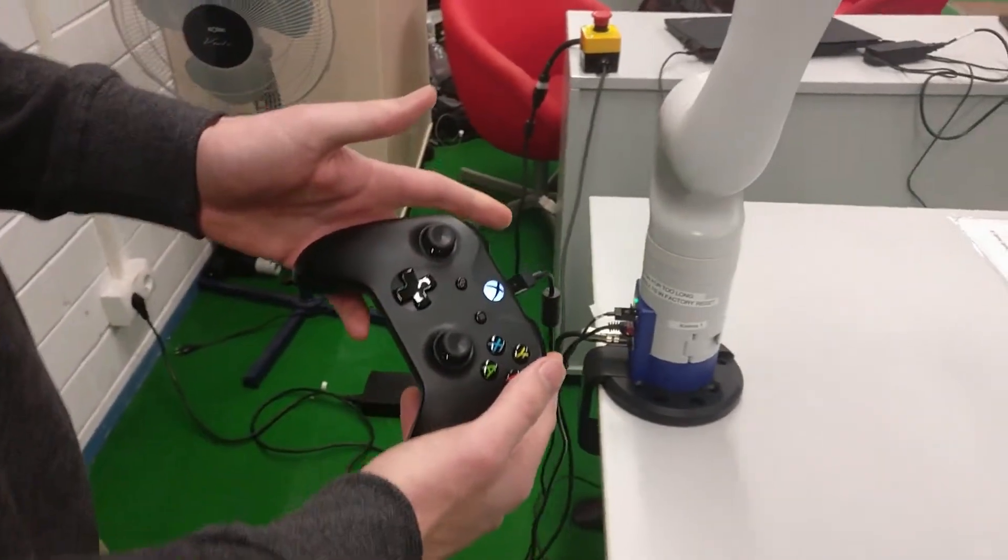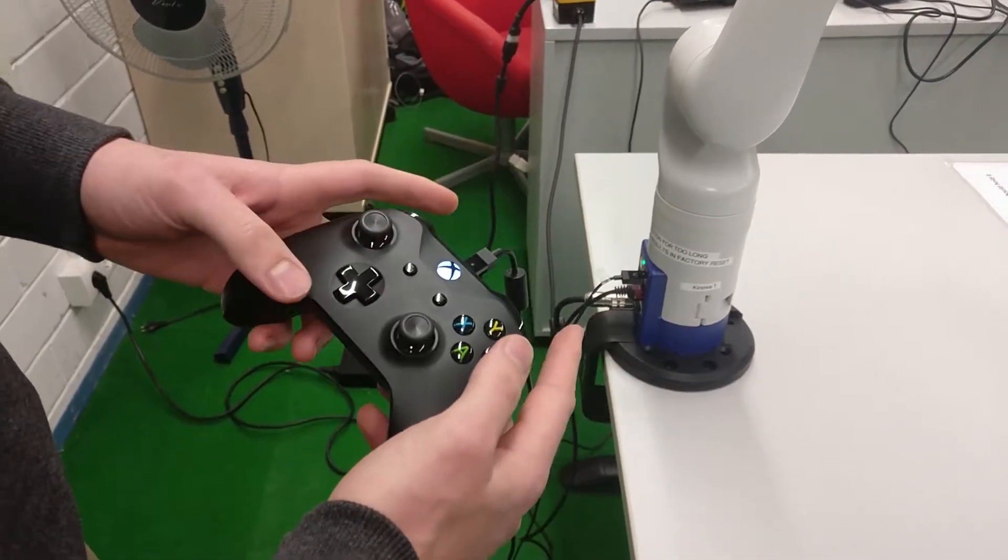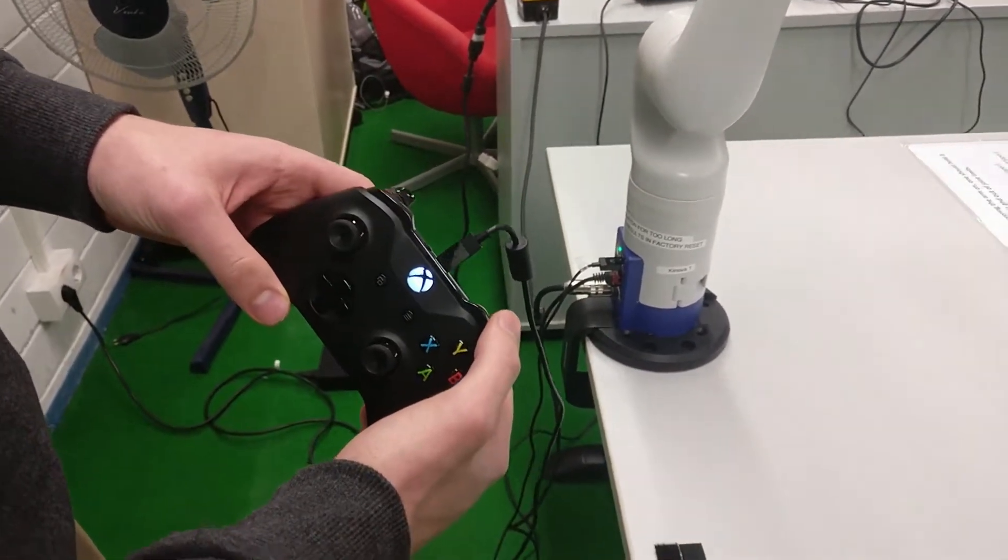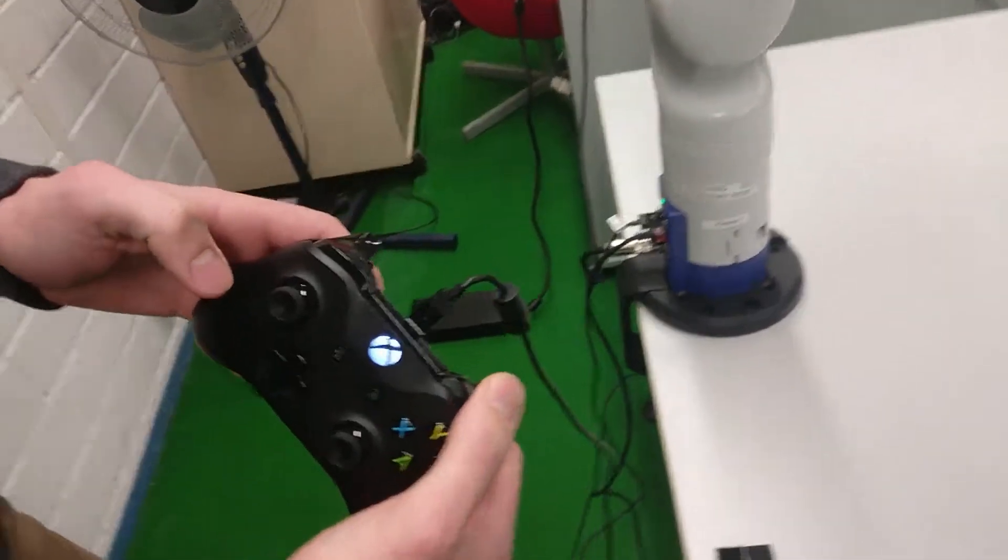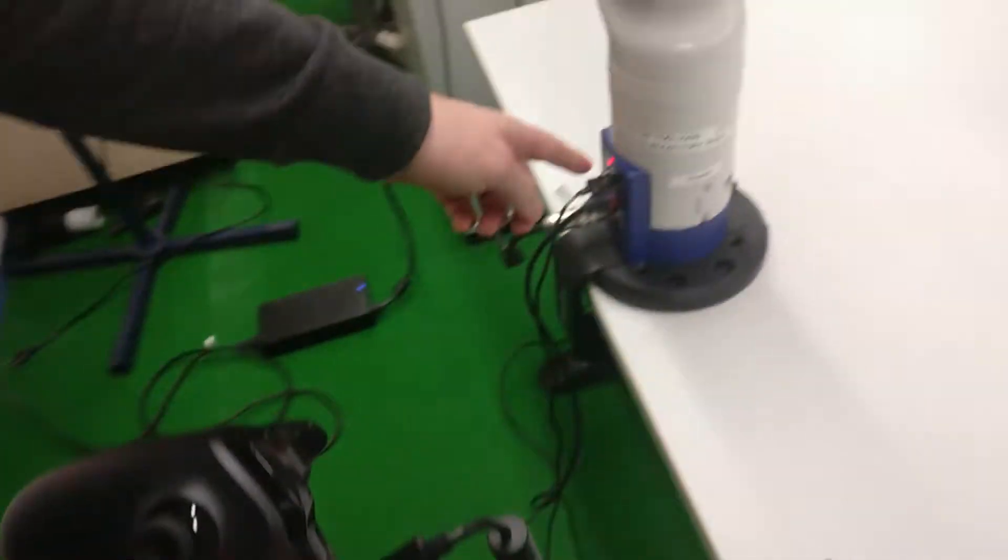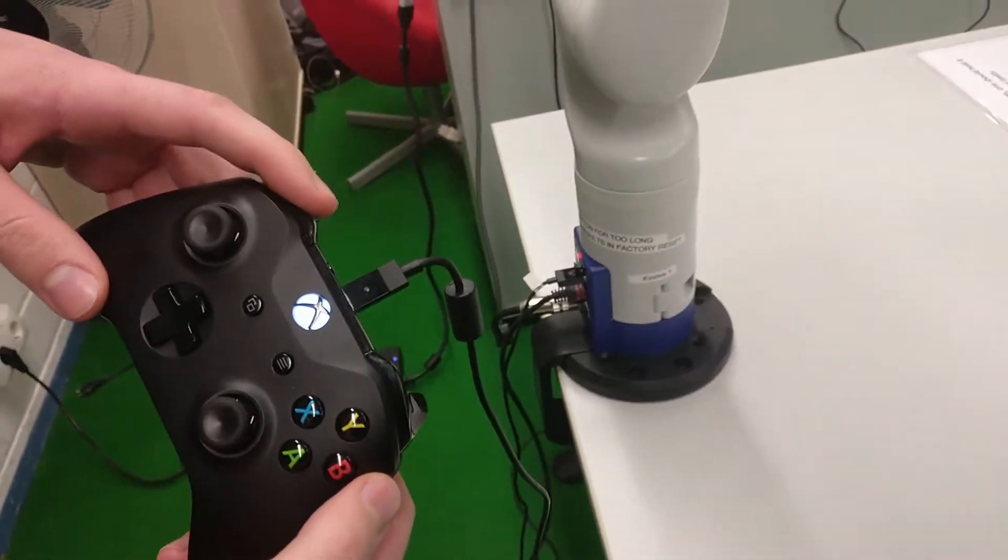The controls are quite basic, using the joysticks to control the arm. The most important ones are the safety soft stop here, where you can see the light turns red, and then resume, which is here.